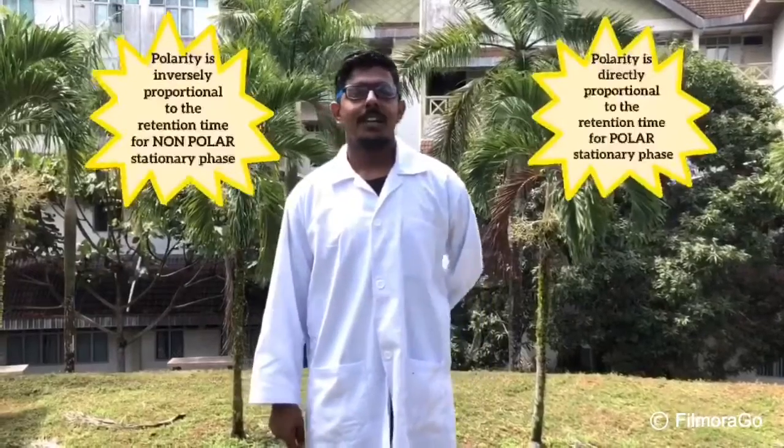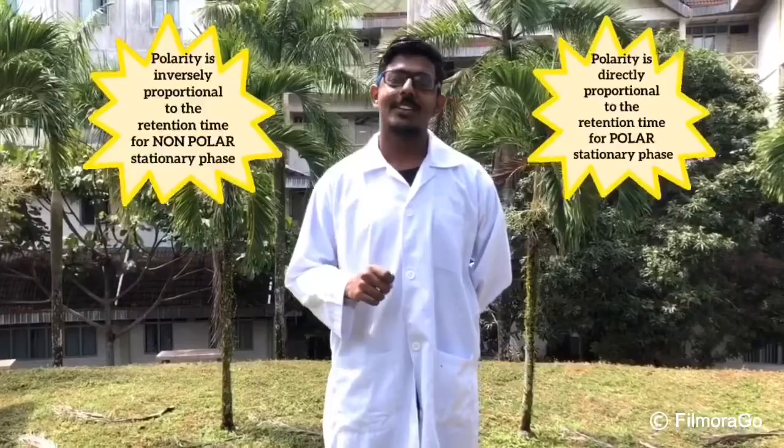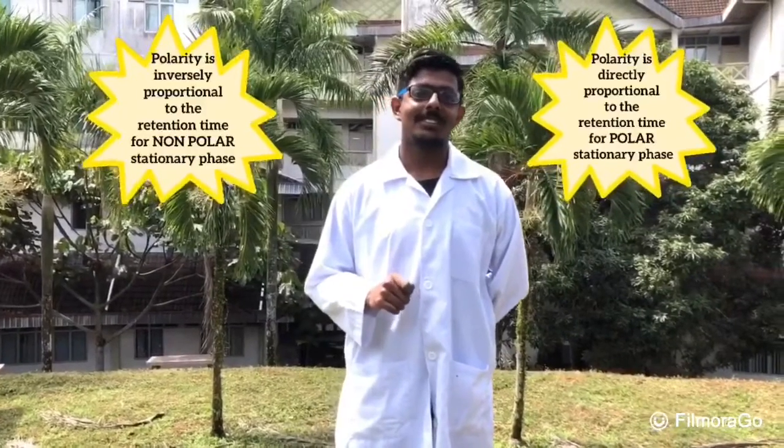Meanwhile, non-polar compounds will not stay in the system and will easily exit the stationary phase, and therefore their retention time will be shorter. That shows that retention time is directly proportional to the polarity of the compounds.